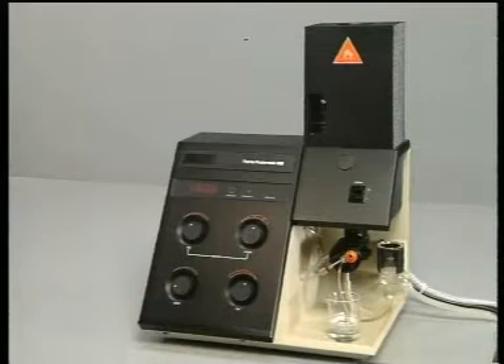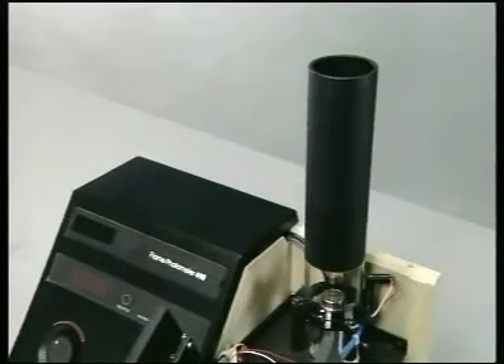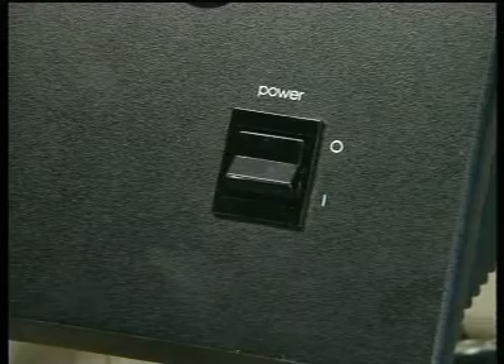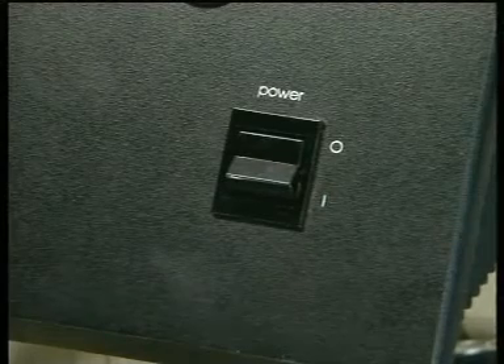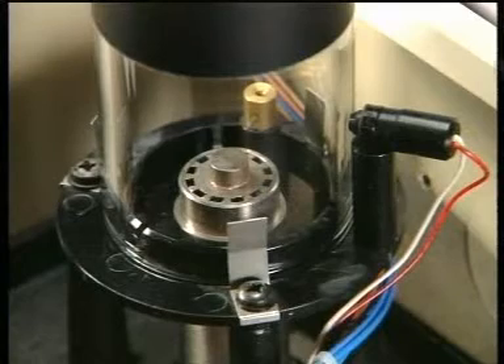The way in which this automated instrument works is best seen with the protective hood around the burner assembly removed. Switching on the instrument automatically opens valves in the air and gas supplies, and this instrument automatically ignites the fuel-air mixture.